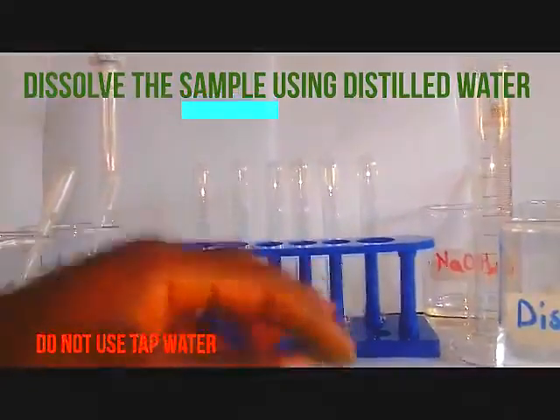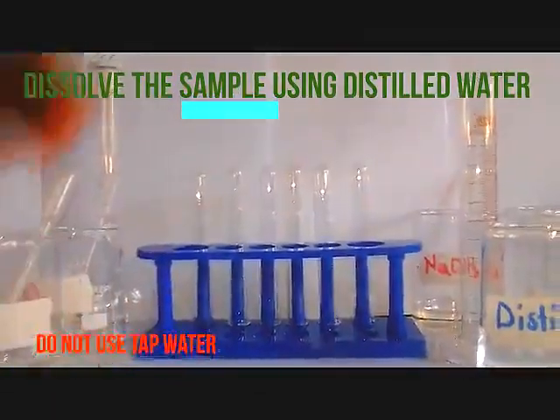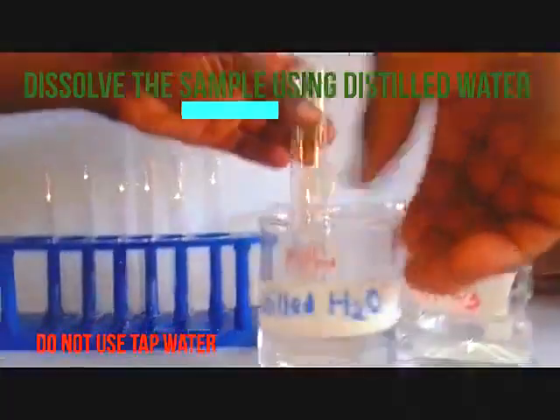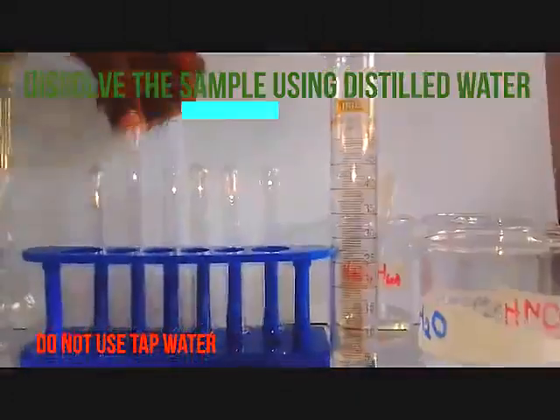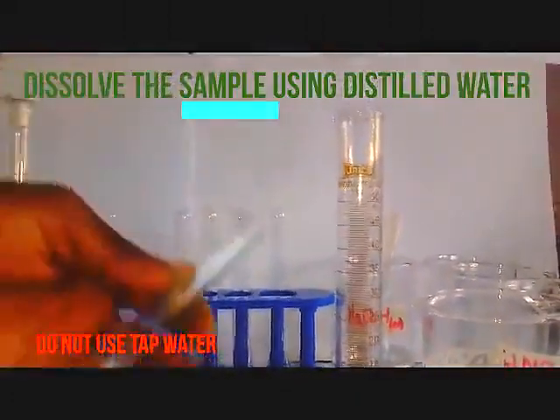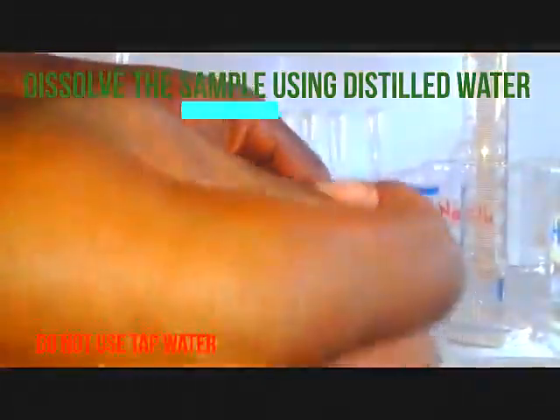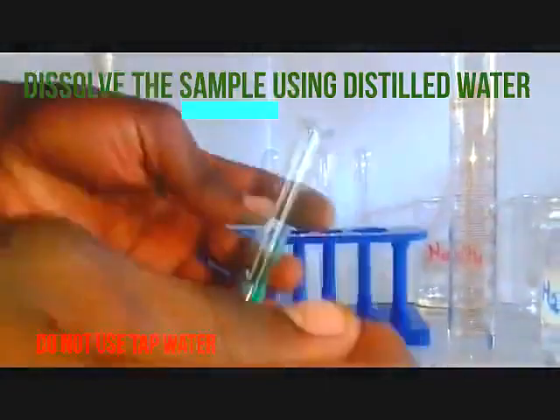We shall heat in the other series. So we are going to dissolve our sample directly using distilled water. Before using distilled water, I should use a small portion. Get our test tube. So you use a spatula, you get a sample, and you add it there.